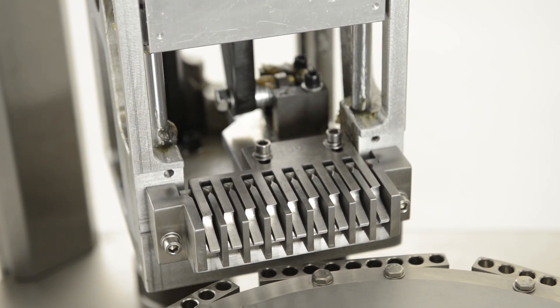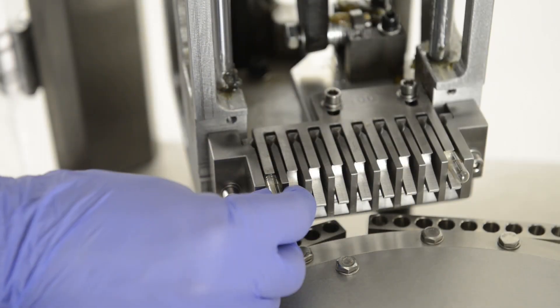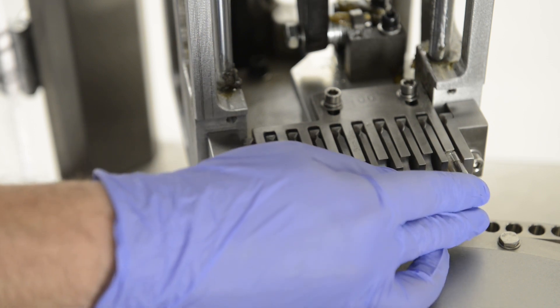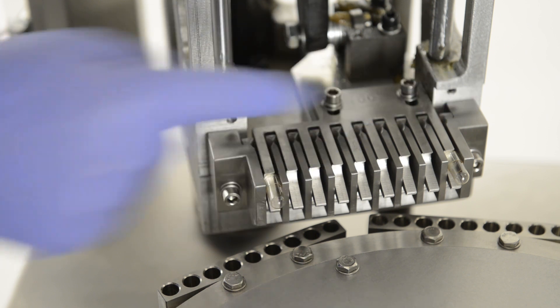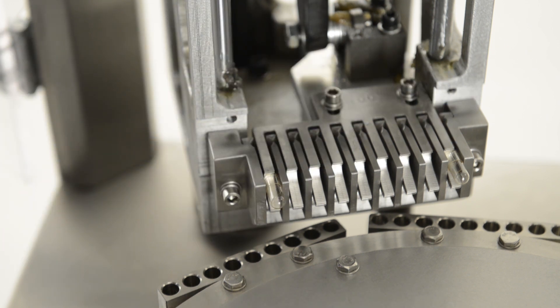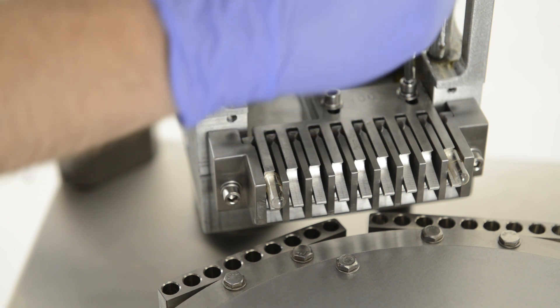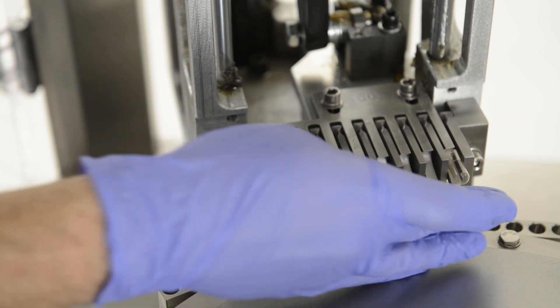Now take two capsules and place them into the end slots, making sure the line of the capsule is in line with the front teeth. Also make sure the two separate teeth are not touching and are equally spaced in front of each other. Now start to tighten the two bolts on top of the back teeth. Do this equally in small increments whilst checking the two caps, making sure they're still aligned whilst doing this.